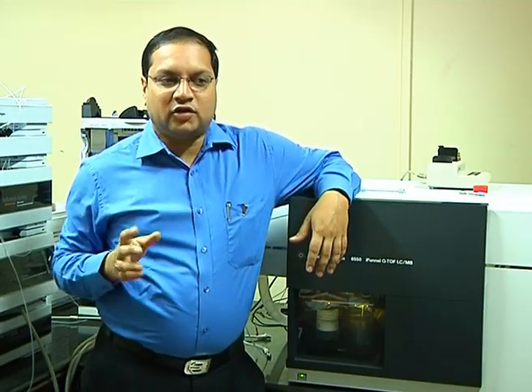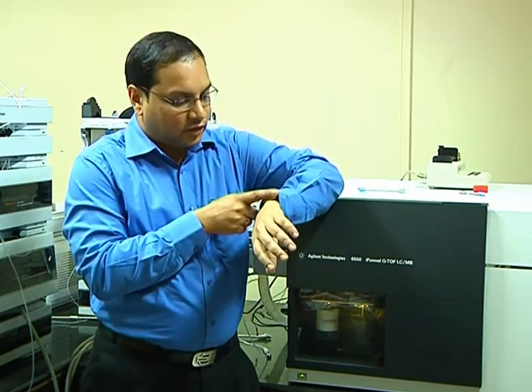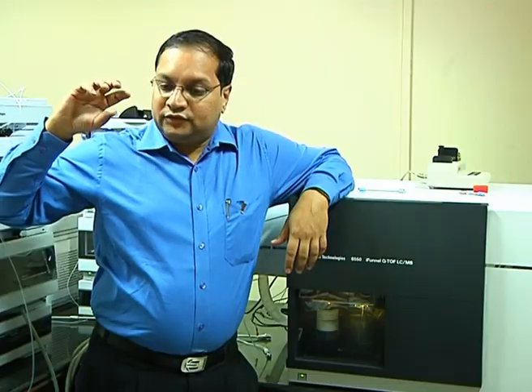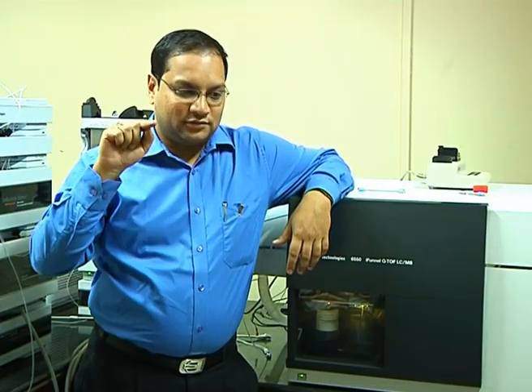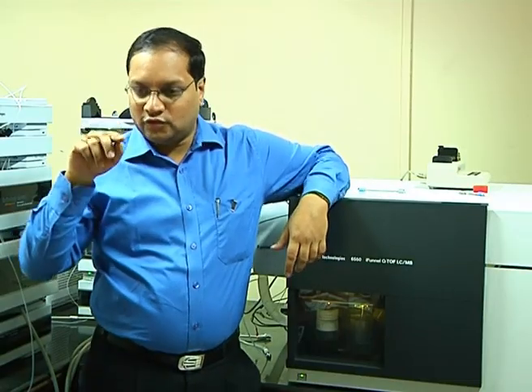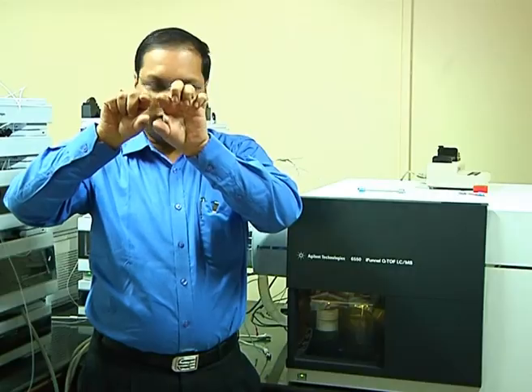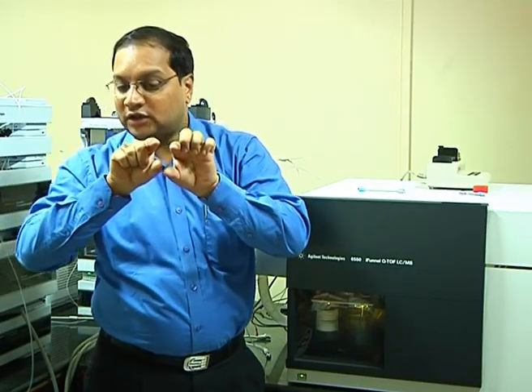So quadrupole is also called a mass filter, or mass filter analyzer, because of the way it behaves. Quadrupole is what? Four rods. Four rods like this, positioned like this, at some length. So what is the logic?